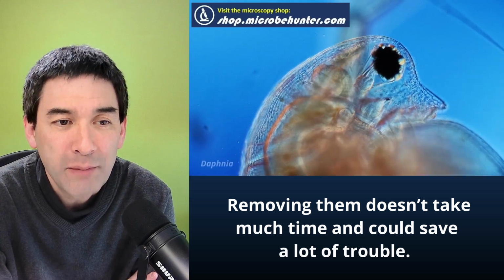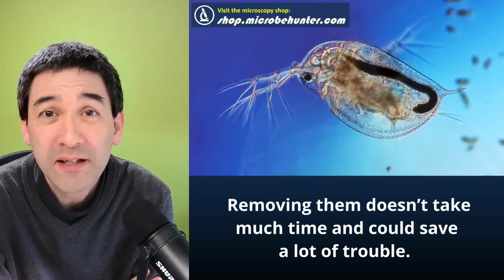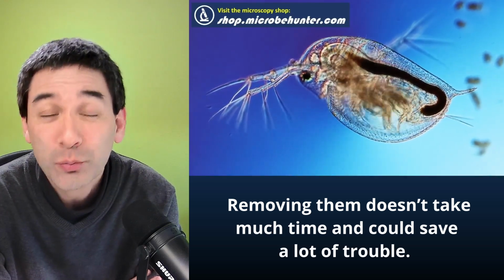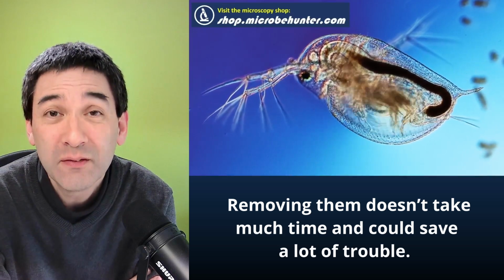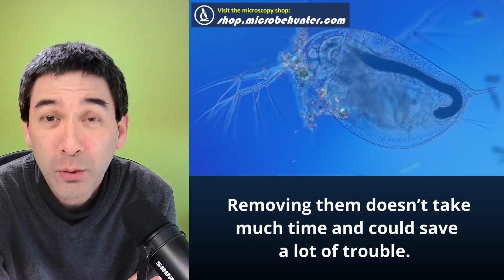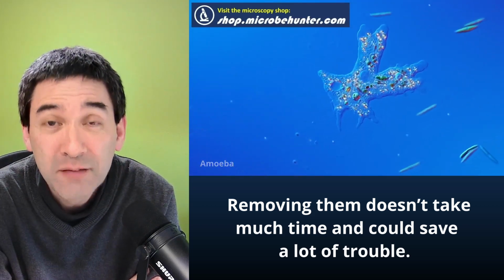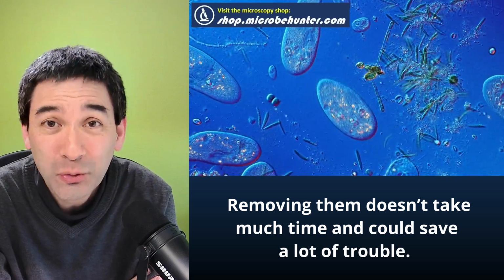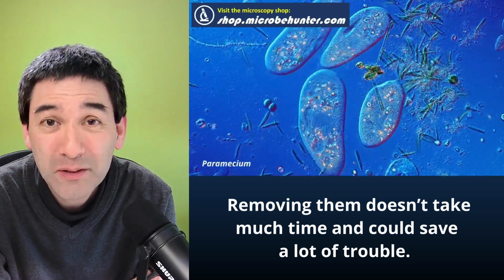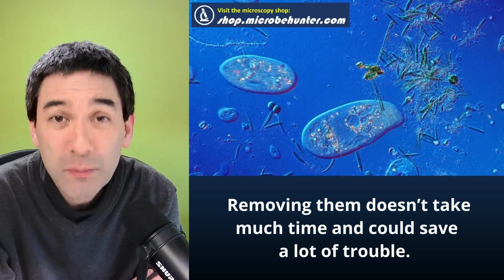So a little bit of background information here. In the case of oil immersion microscopy, what you have to do is place a drop of immersion oil on the microscope slide, and then the oil immersion objective, that's usually the 100 times objective, is directly rotated into the oil. This means that the objective becomes essentially contaminated with oil, and it's specifically manufactured like this so that the oil is not going to do any damage. Later on you want to use some lens paper, not just regular tissue paper, to remove the oil.